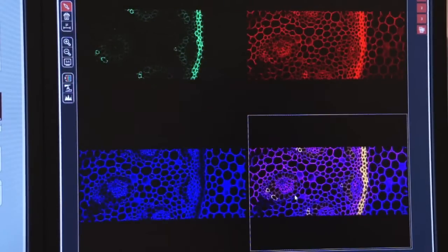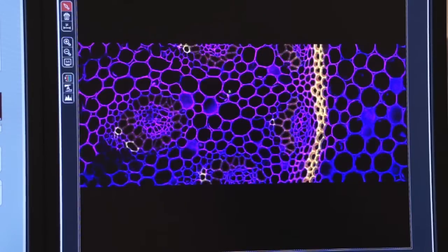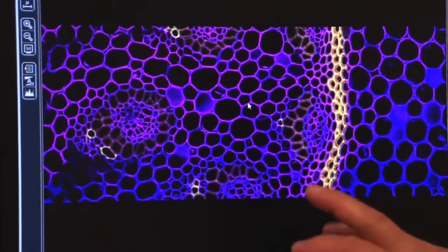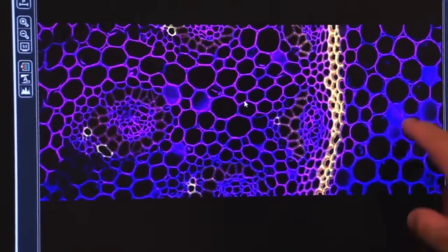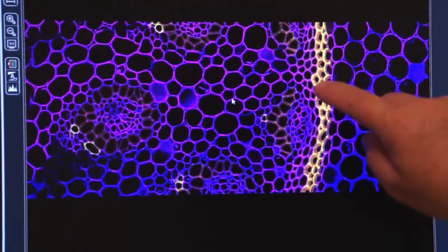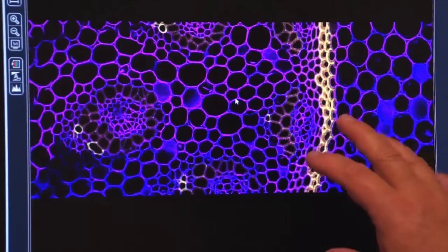the composite image showing all of this information output into one different image. We have 3 distinct colors here. We have a blue color, a pink color, and then a golden color, actually a 4th color, sort of a brownish color. So we're really getting a lot of information back by engaging all of these PMTs.